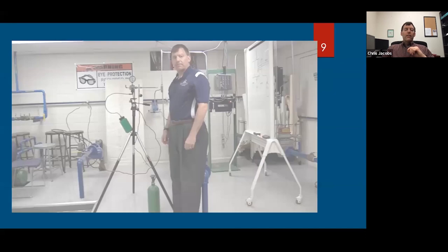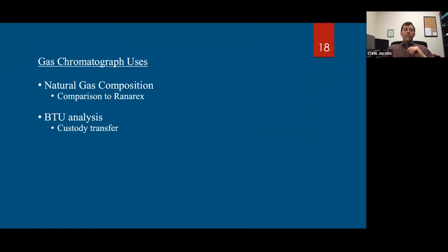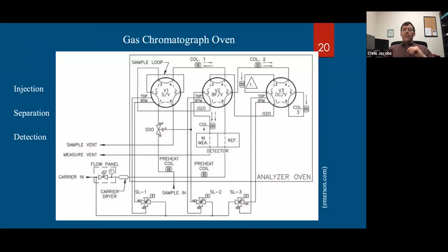It's a good question. So if we look at the actual diagram of the chromatograph here, what we will see is the reference detector has to measure the carrier gas, in this case, helium. Because if we do not know what the characteristics of helium are, and remember, we're using helium to transport our gas sample through the chromatograph. Helium is always flowing through the chromatograph. If we have not isolated the signature of the helium, we are going to continuously measure helium on this side, and we're not going to know what the components are.